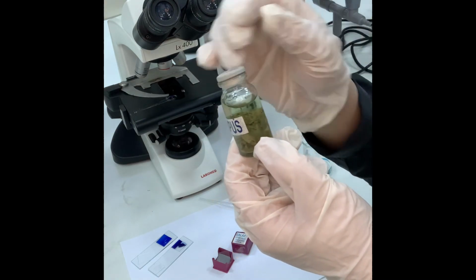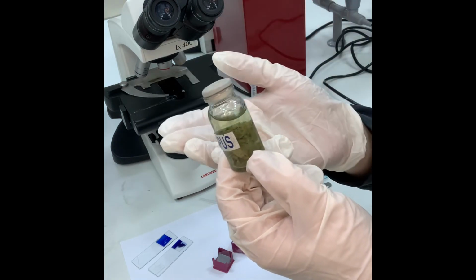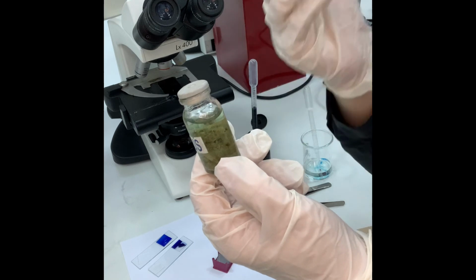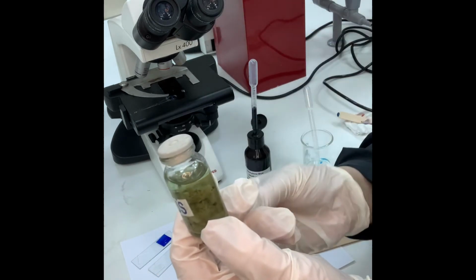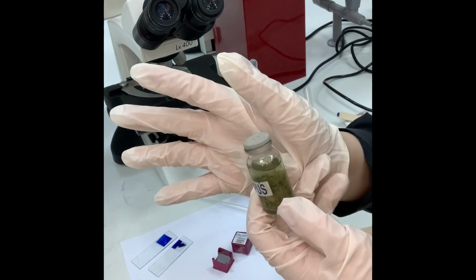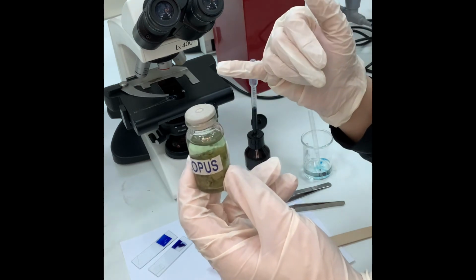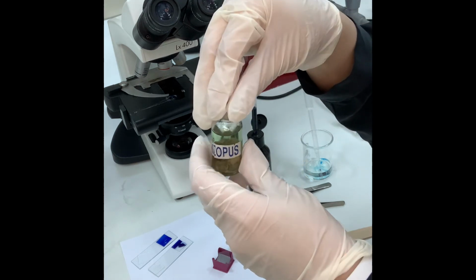Now, why do we add it in alcohol? We call it fixation, in order to make the sample harmless. So this is why we add it in alcohol. Fixation, we're adding the sample in alcohol to make the sample or the specimen harmless to work with. So since this is liquid, I either add directly from here onto this slide and add stain, or you can just use it without a stain. It's very simple and very clear as well.